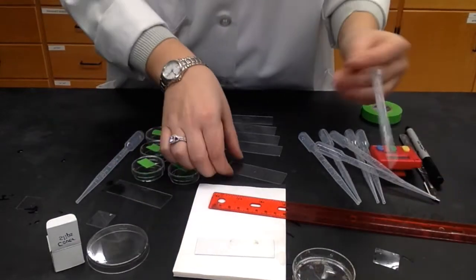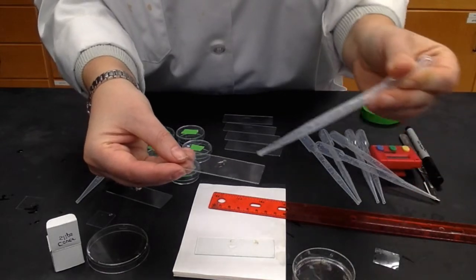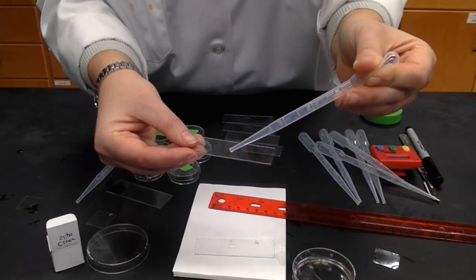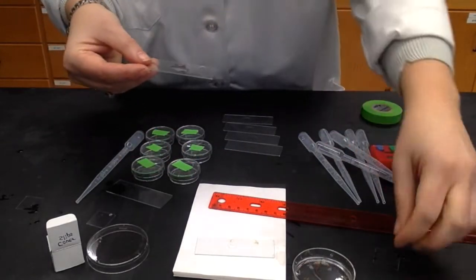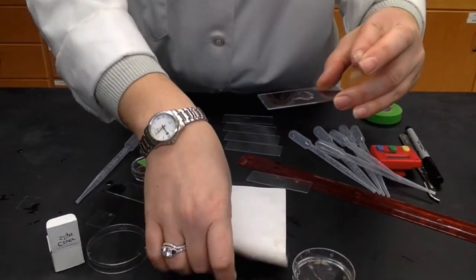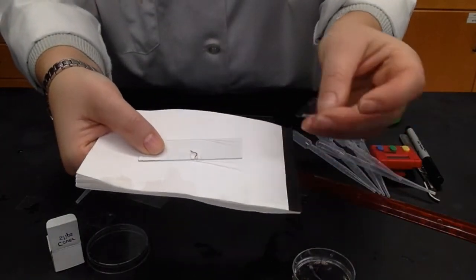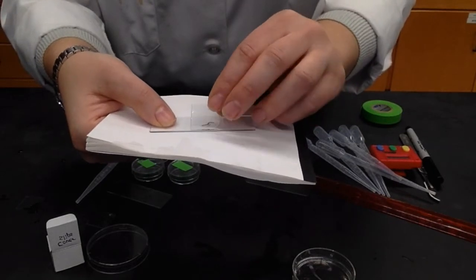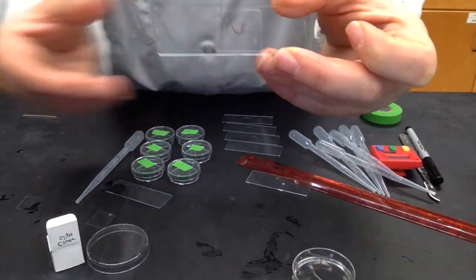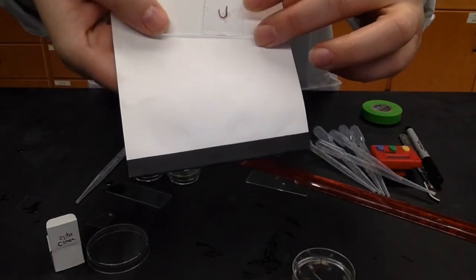You want to make sure that there's enough water on the slide that it will fill the depression so that when you place the cover slip on the slide, it won't crush the worm. Now you can place one of your cover slips onto the slide containing the worm. This is where you take your baseline reading. So you can see you've got the worm on the slide, gently placing the cover slip onto the portion of the worm. And now here you can clearly see that there's a segment of a worm on the slide.